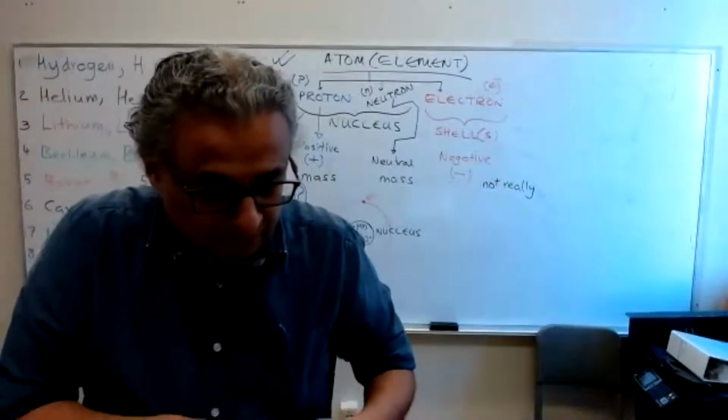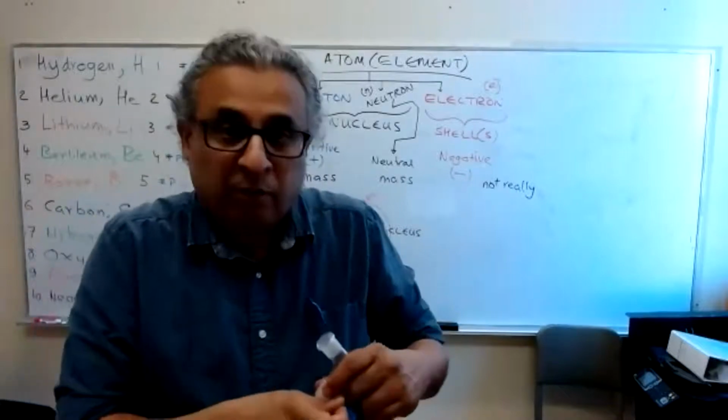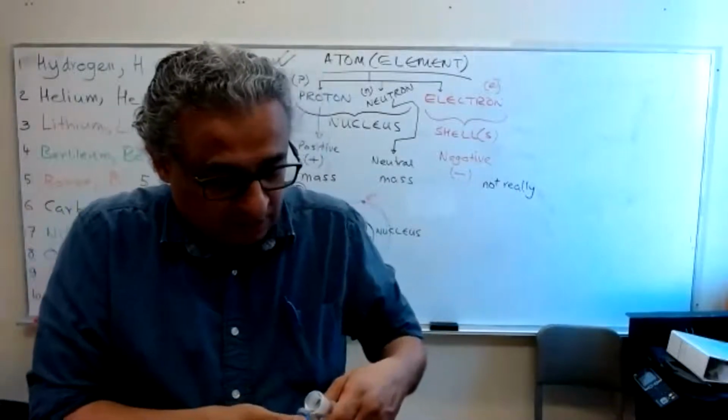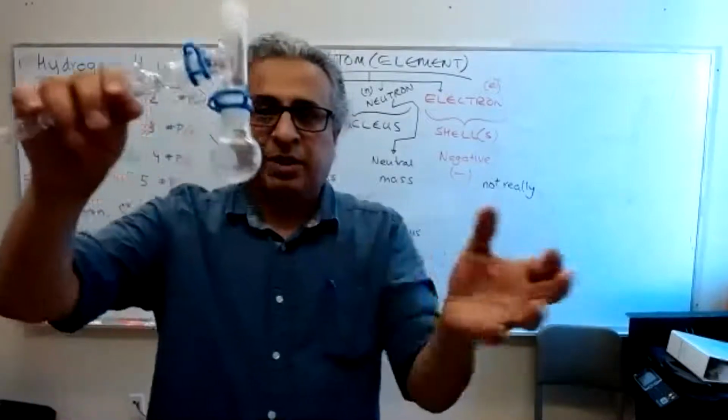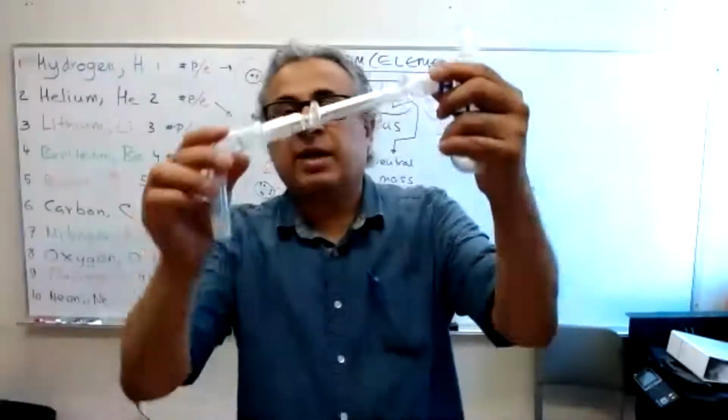So I'm just clamping them in case something falls out of my hand. I don't want to clean up broken glass in my office. I'll be the last one to do that. Now it's pretty secure, okay? Then this guy is attached at the end.